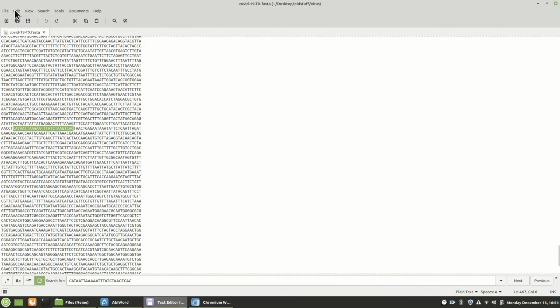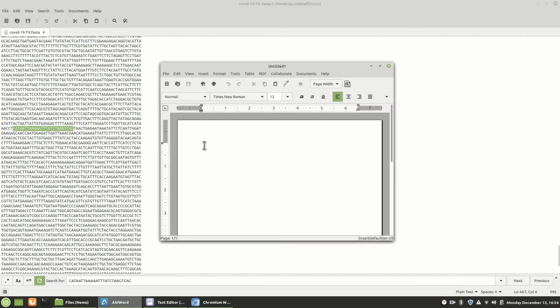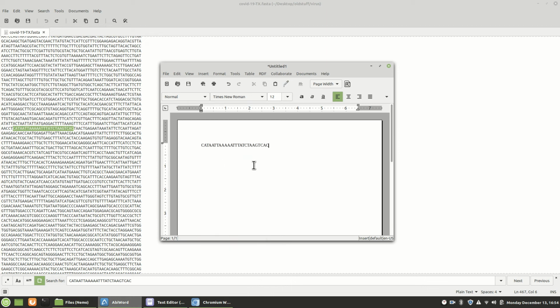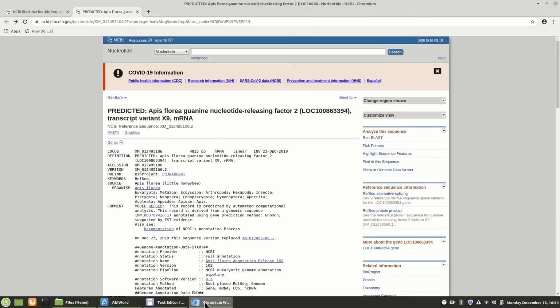All right, so edit, copy. And of course, tell me what your gene is, but here's your sequence. So put your name and everything and what sequence you had, and specifically what sequence you had. And then we're going to report that it was this.